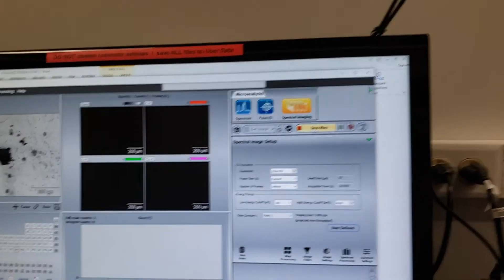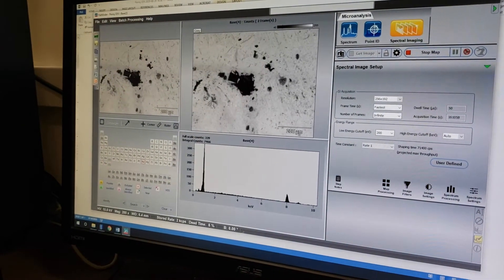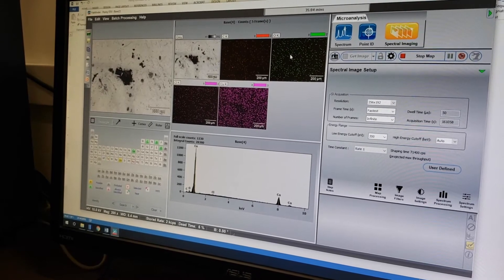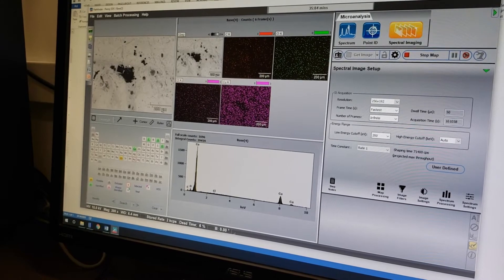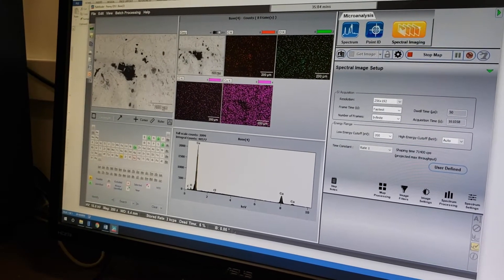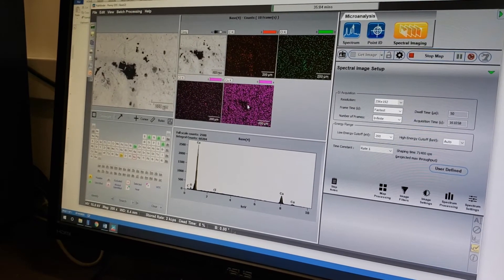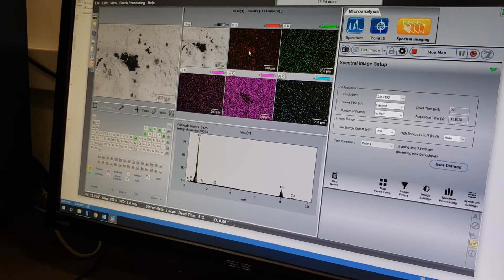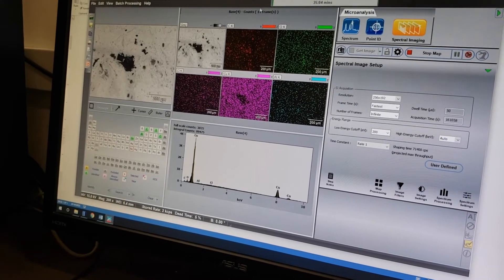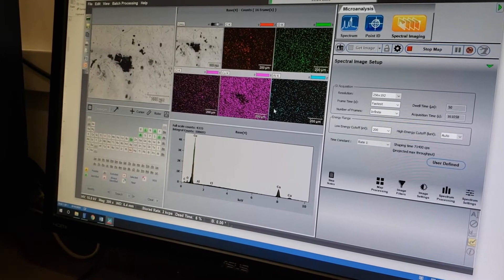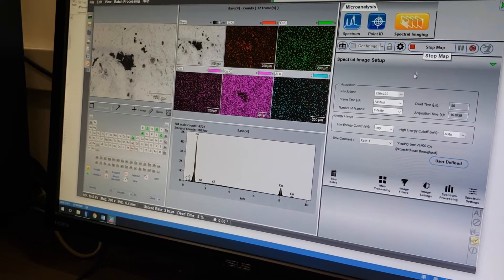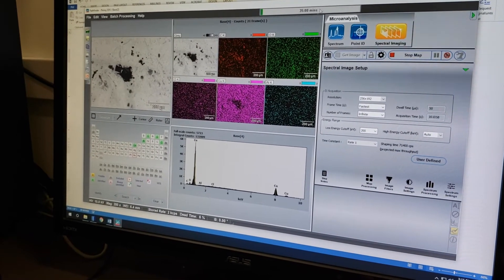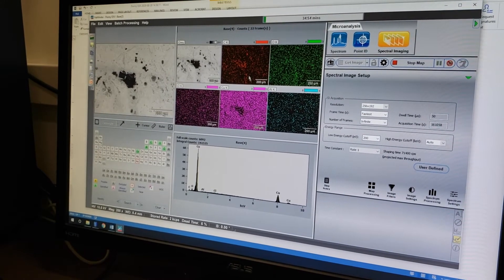That goes into collecting mode. First you get a low-pixel gray image, then it starts giving dots showing where elements are located. From our point scan, we know this speck is mostly carbon and the surrounding area is mostly copper — you can already see that developing, with a hole in the pink copper region and a denser carbon region in the middle. We keep an eye on the number of frames, and when the results look good enough, we click Stop Map.